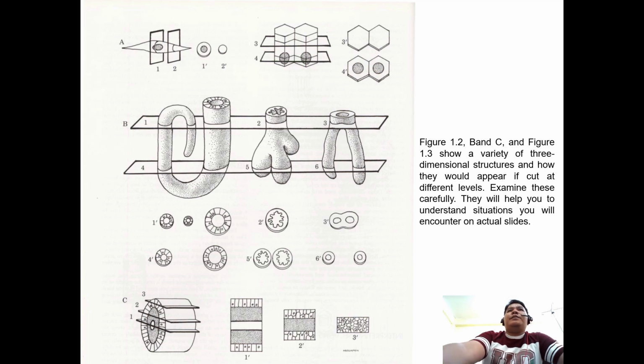Imagine how the spindle shape and the tall columnar cells shown in this figure appear in various planes. Note also that the nucleus may or may not be included in a particular cut through a cell. Histologists examine multicellular structures having a wide variety of shapes. Some are hollow, some branch repeatedly, and some open onto surfaces, etc.